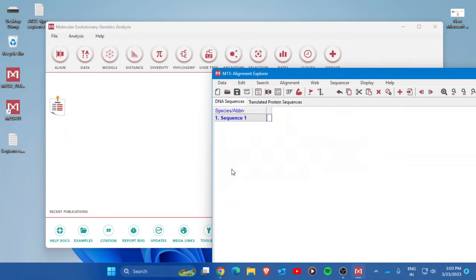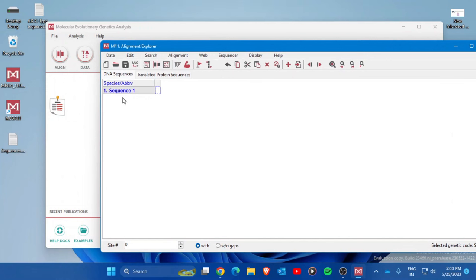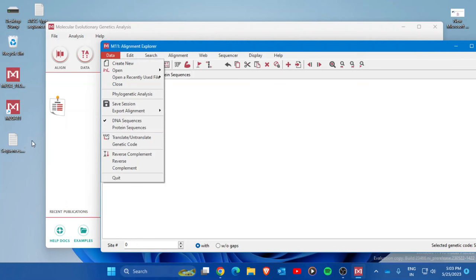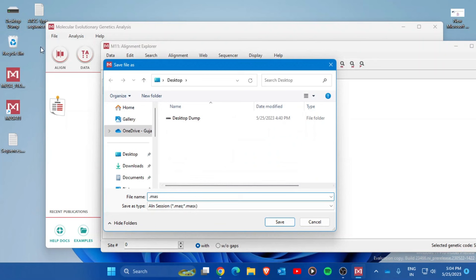A new alignment window will open. Go to the Data option and press Open, then choose 'Retrieve Sequences from File'. It will prompt you to save the alignment before importing — press Yes and give it a name like 'alignment'. The extension will default to .mas — press Save.